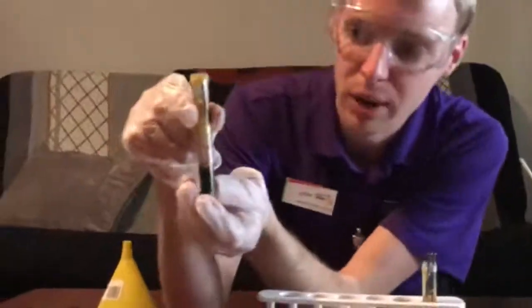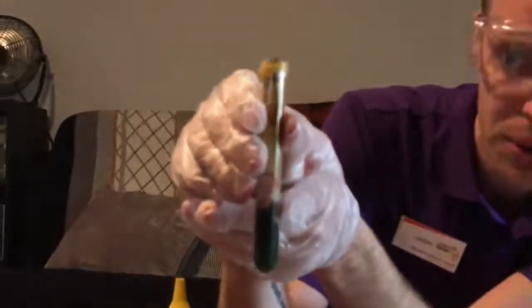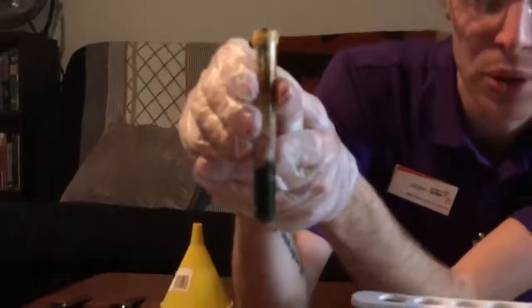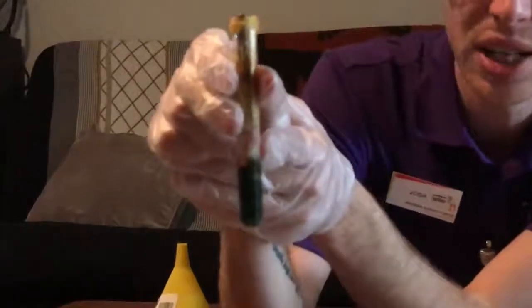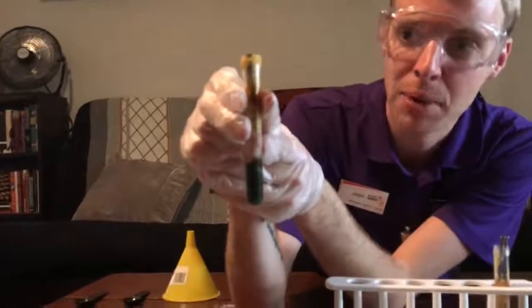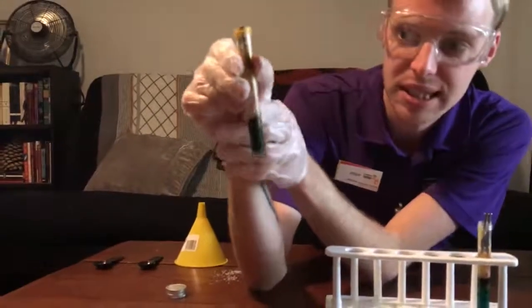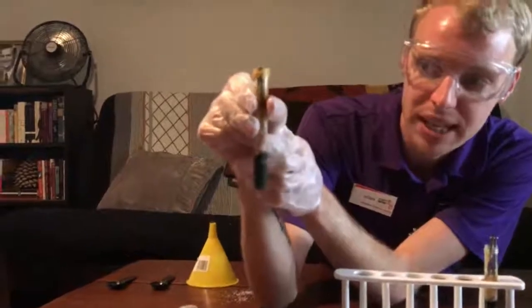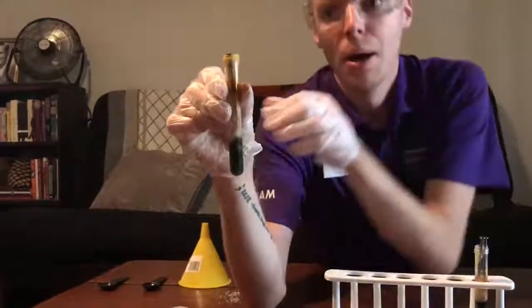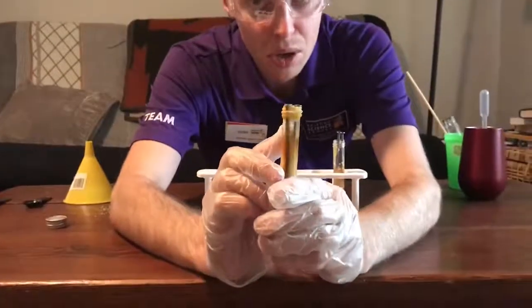actually form wherever the copper gets left alone. So if you see that beautiful, brilliant copper, this is something that has been growing for 3 days, and this reaction will probably continue to occur for another day, maybe 2 or 3 days, depending on how much water you use in your own. And if you look, you can see that this got left alone once all the water had been taken out of the salt layer. But the other really interesting part is we're starting to see these formations all along the top.